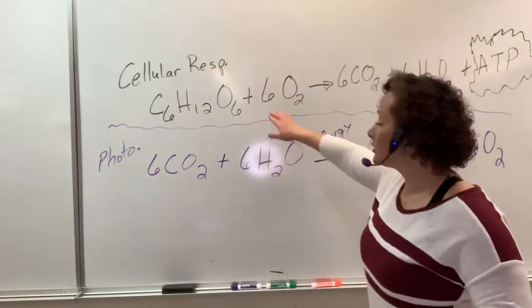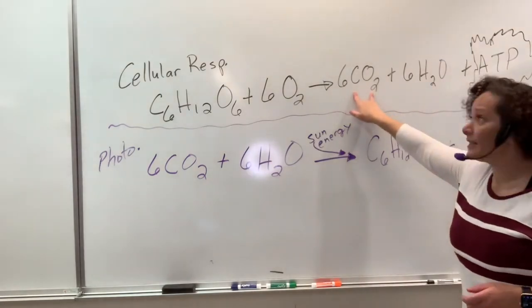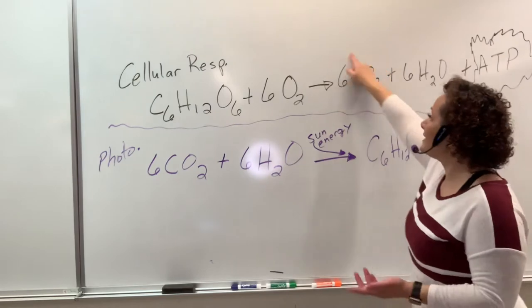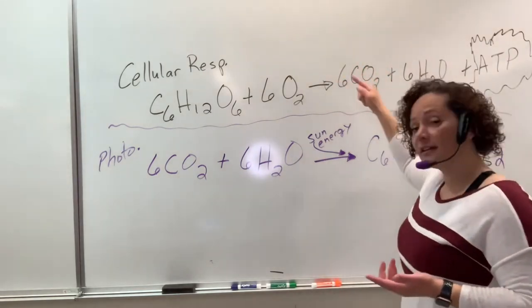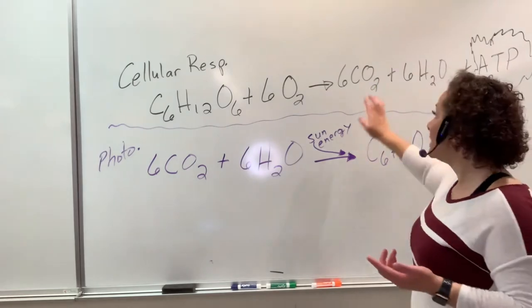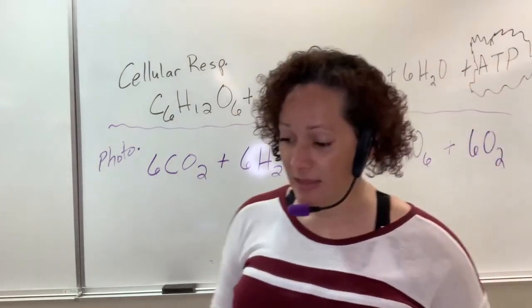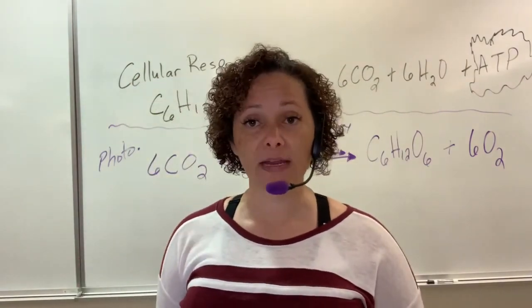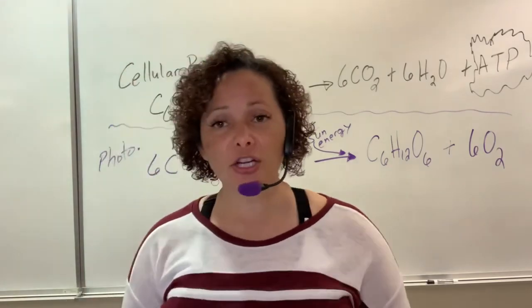If we're working on cellular respiration and CO2 is coming out of the reaction of whatever organism we're testing, this is how we're going to figure out the levels of cellular respiration of our organism, depending on the amount of CO2, and that is calculated into a respiration rate, which was on the previous page. So follow the instructions, plug it in.